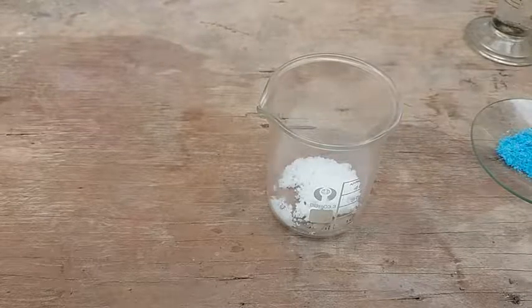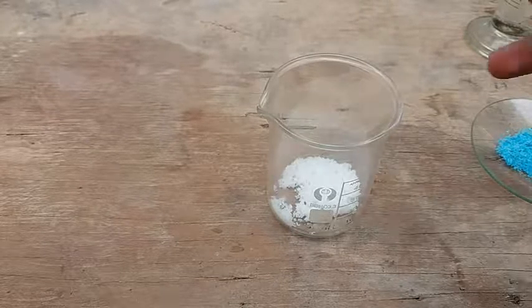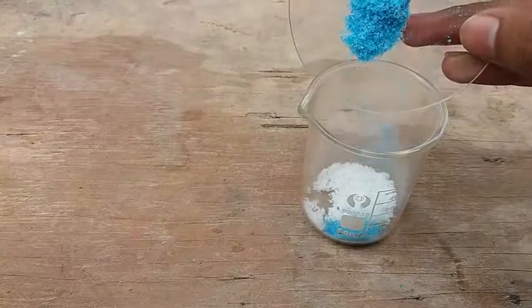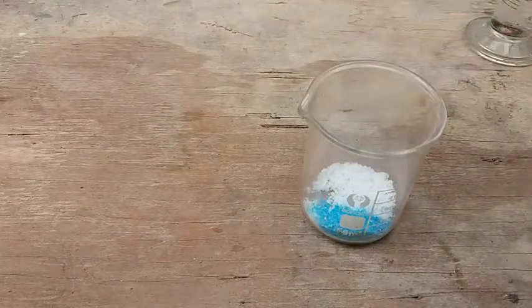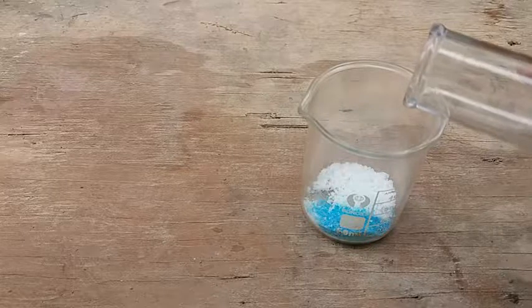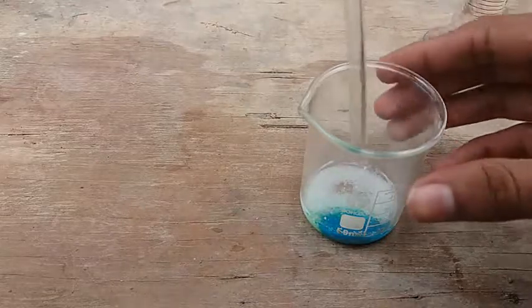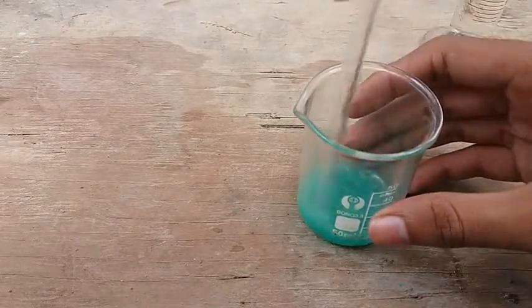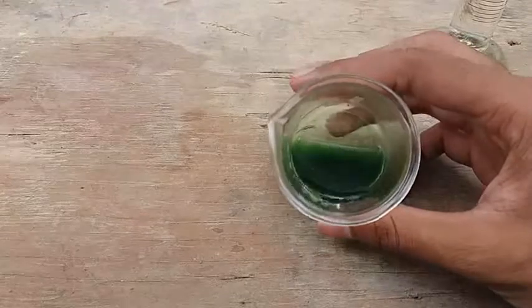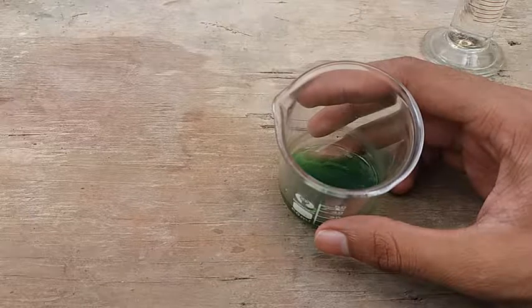Hello everyone. In this video I am going to show you how to make copper chloride. My first method is adding copper sulfate to sodium chloride, and now I am adding a little amount of water. This is my copper chloride solution. This is not a pure solution, however you can use this for PCB etching.